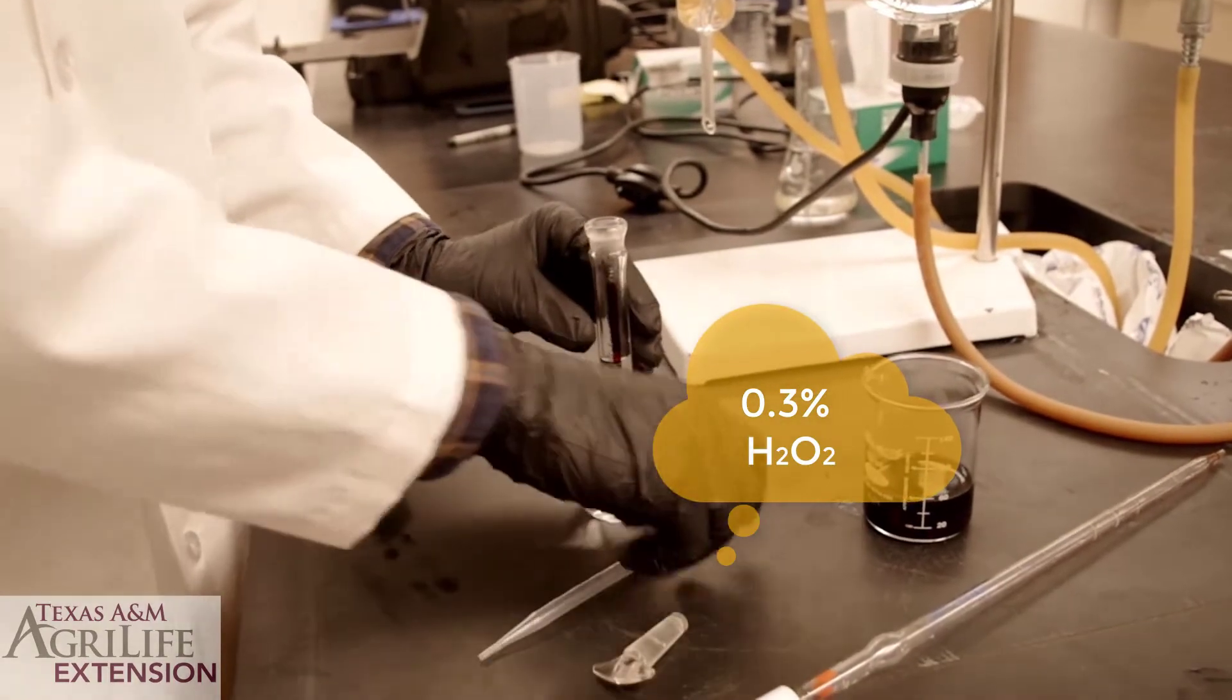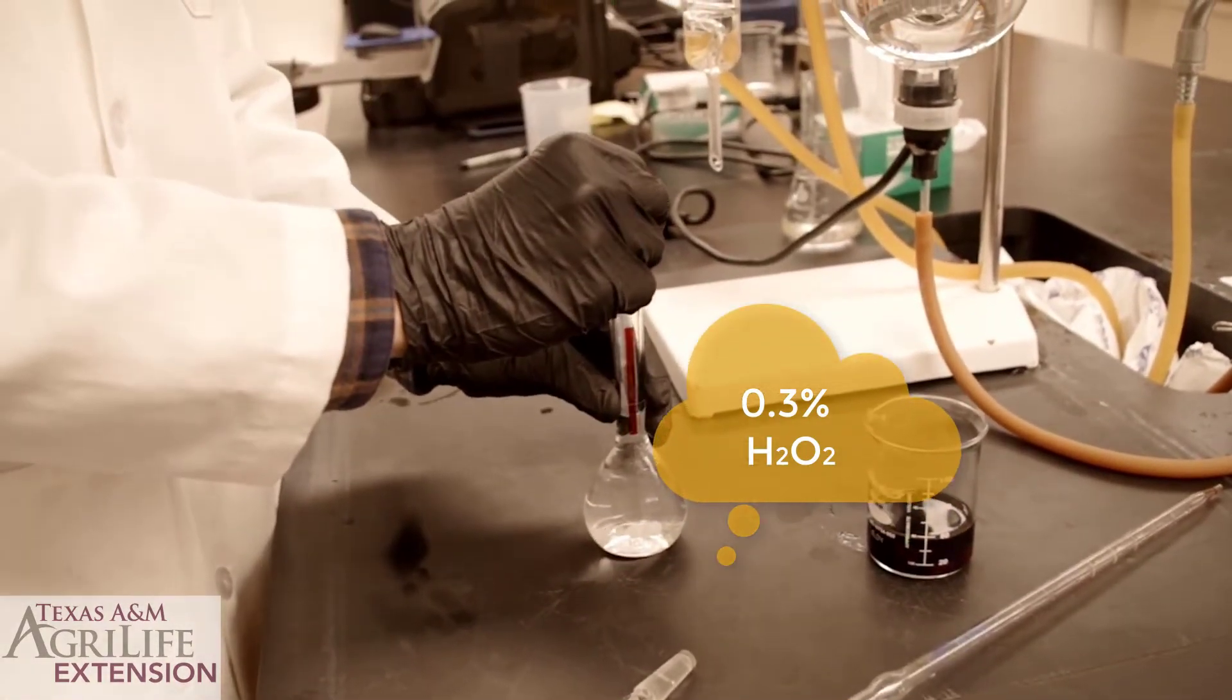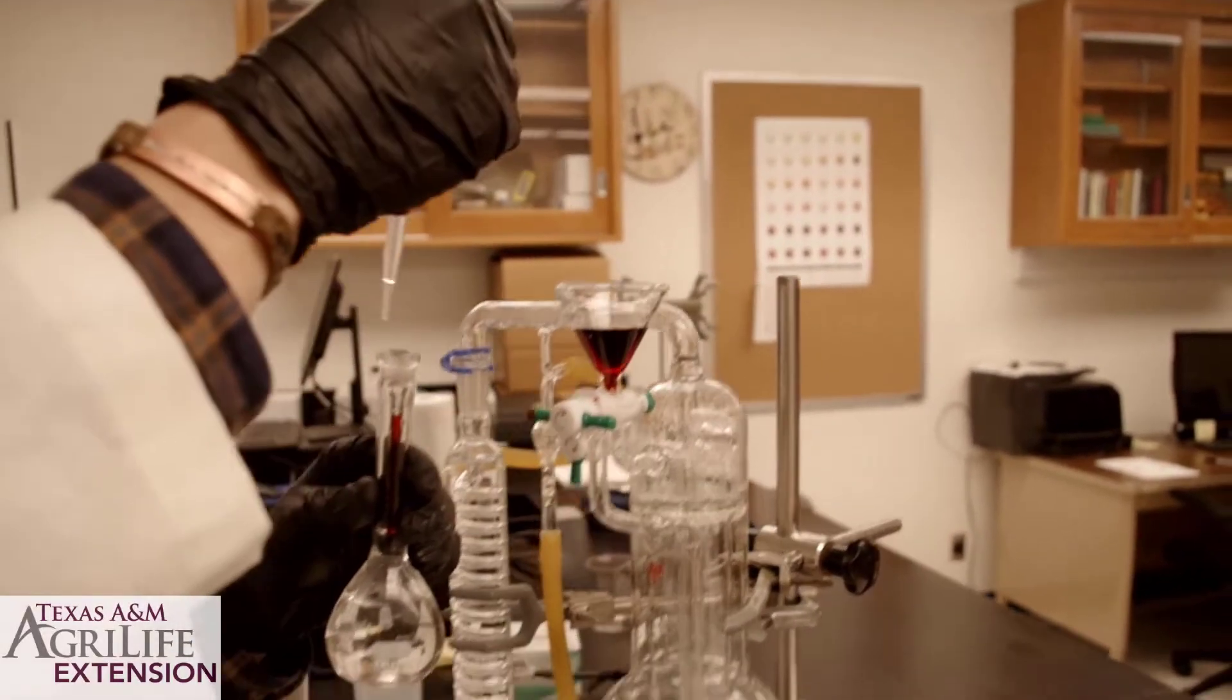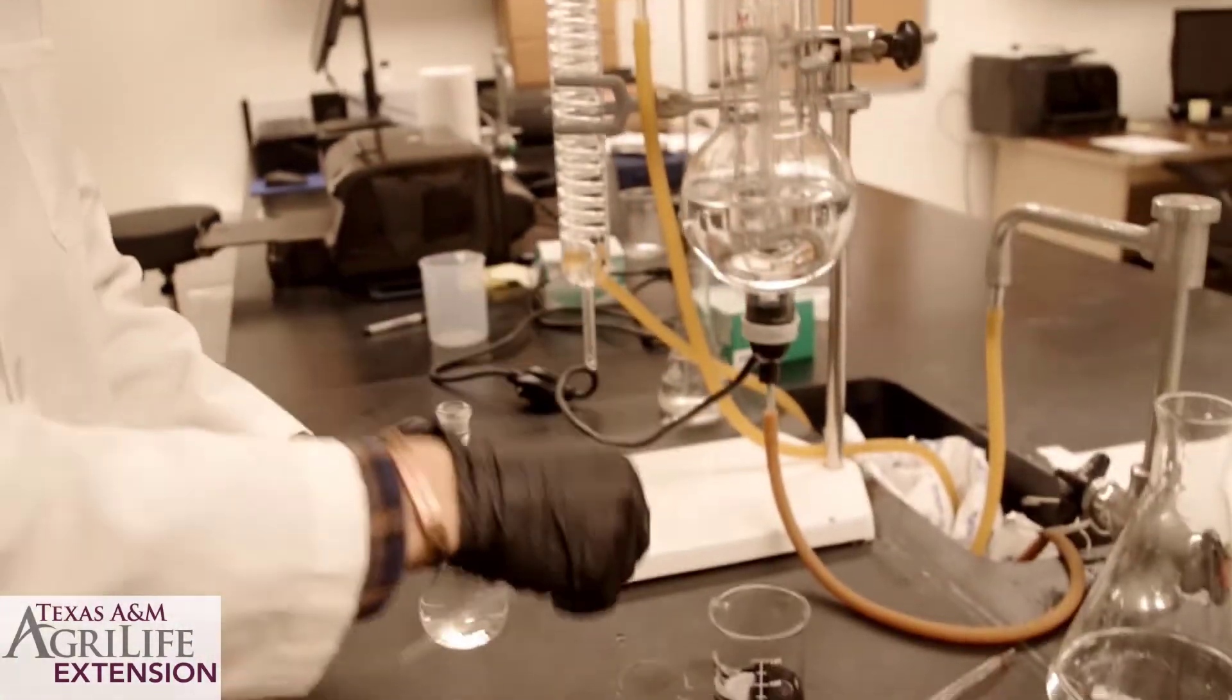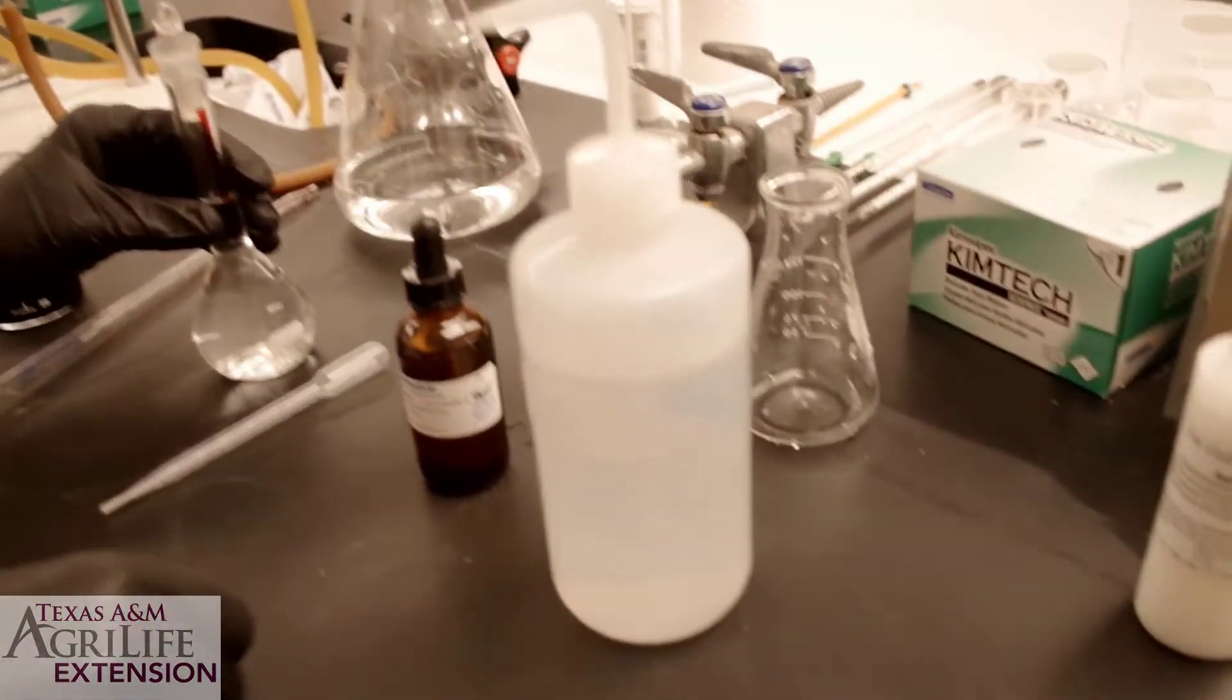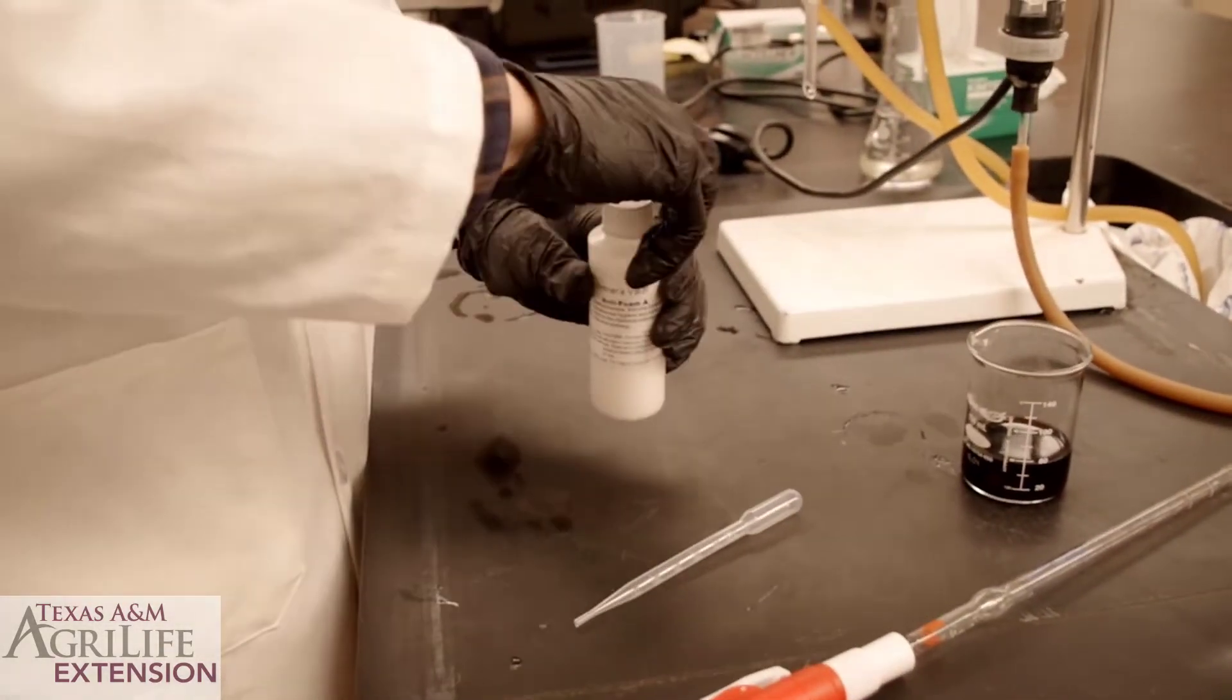Add 3 drops of 0.3% hydrogen peroxide and one drop of anti-foam to the funnel.